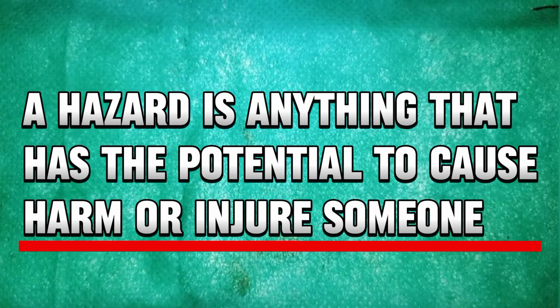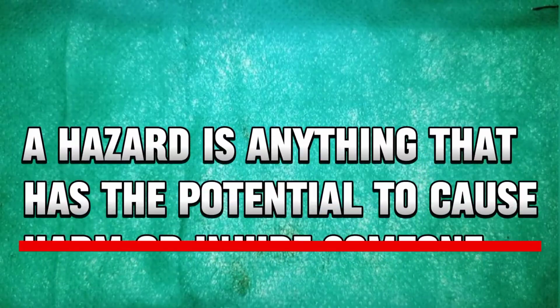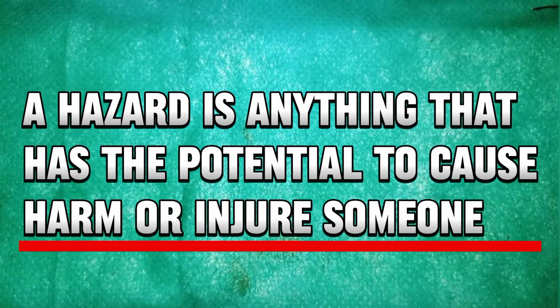That is pre-technical standards in grade 7, and also in grade 8 we have safety threats. So in science we will simplify it: a hazard is anything that has the potential to cause harm or injure someone.